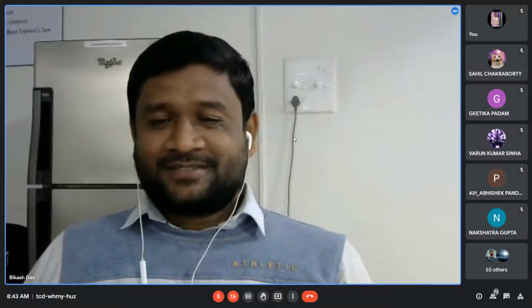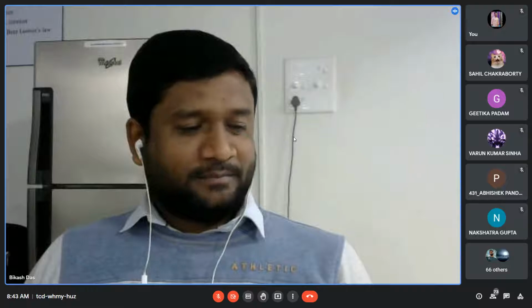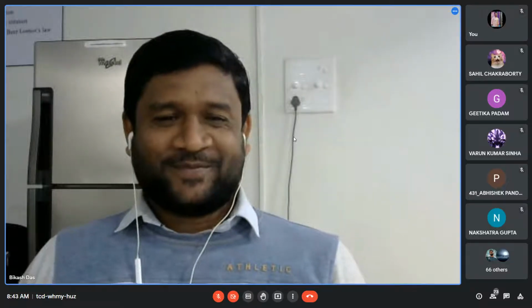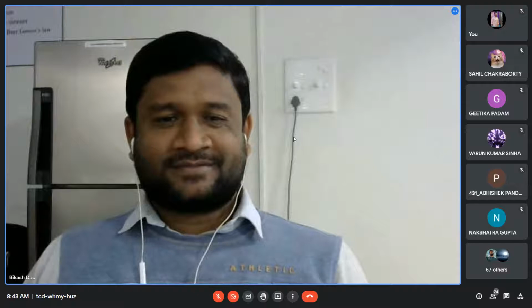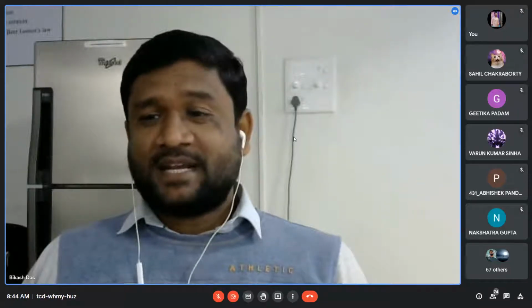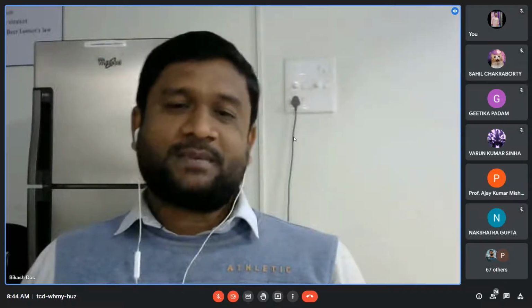So, this is an old experiment. Yes or no? Because the same type of experiments we already finished last year in 2021. pH metric titration. This one is also the same type of experiment.